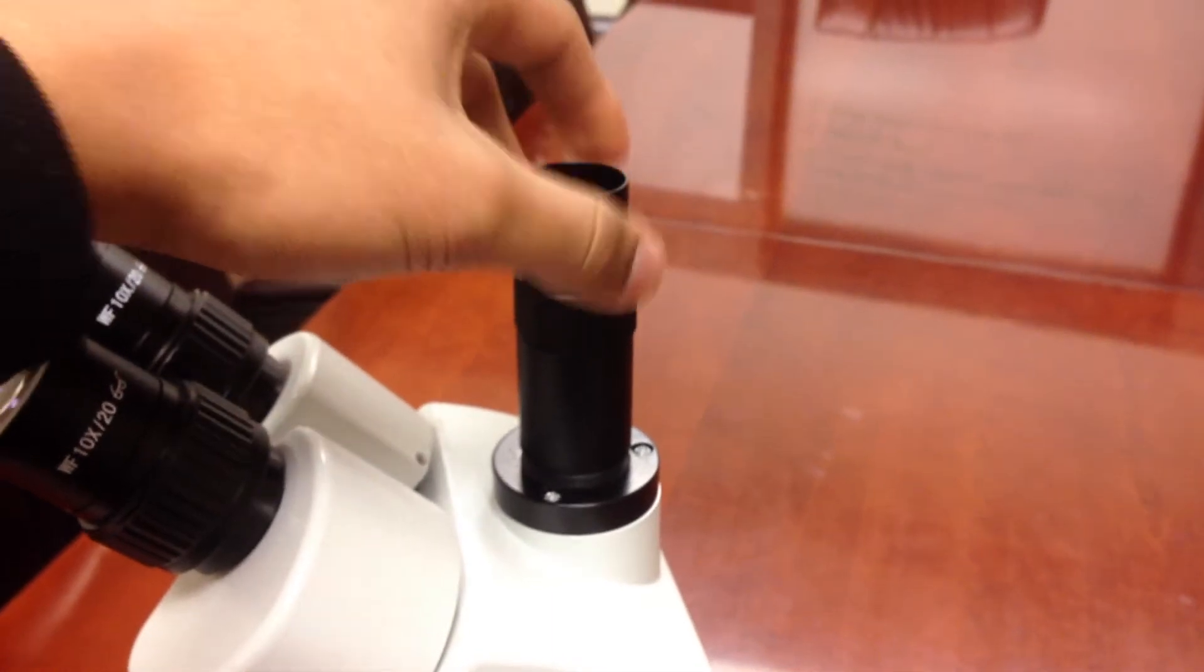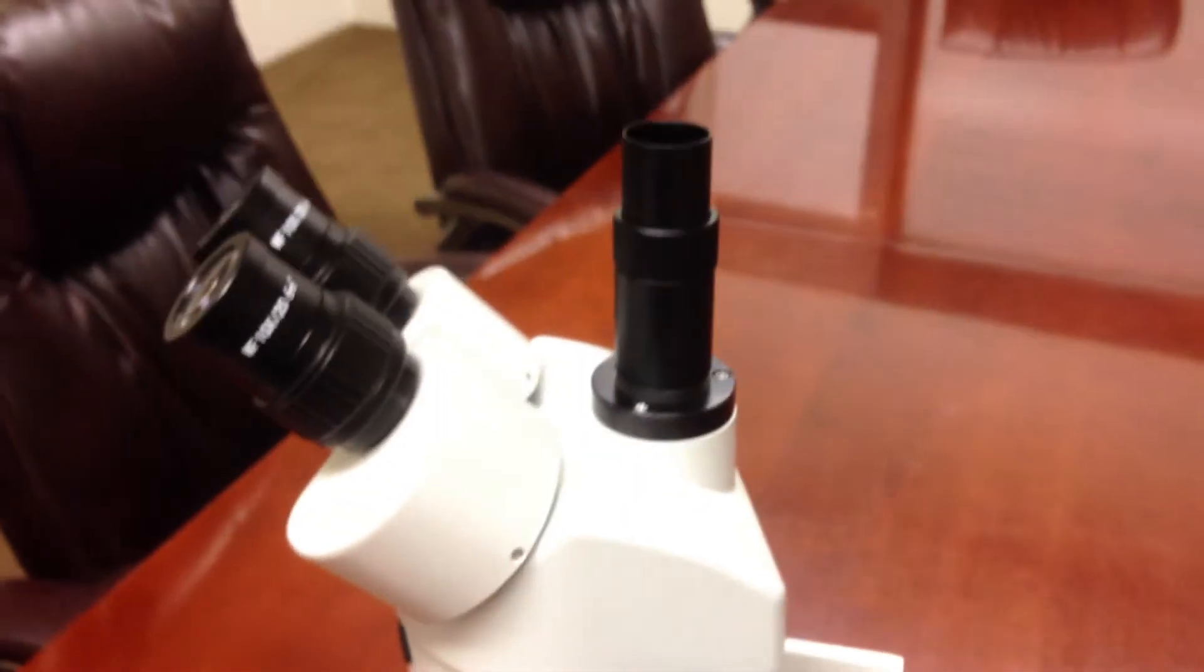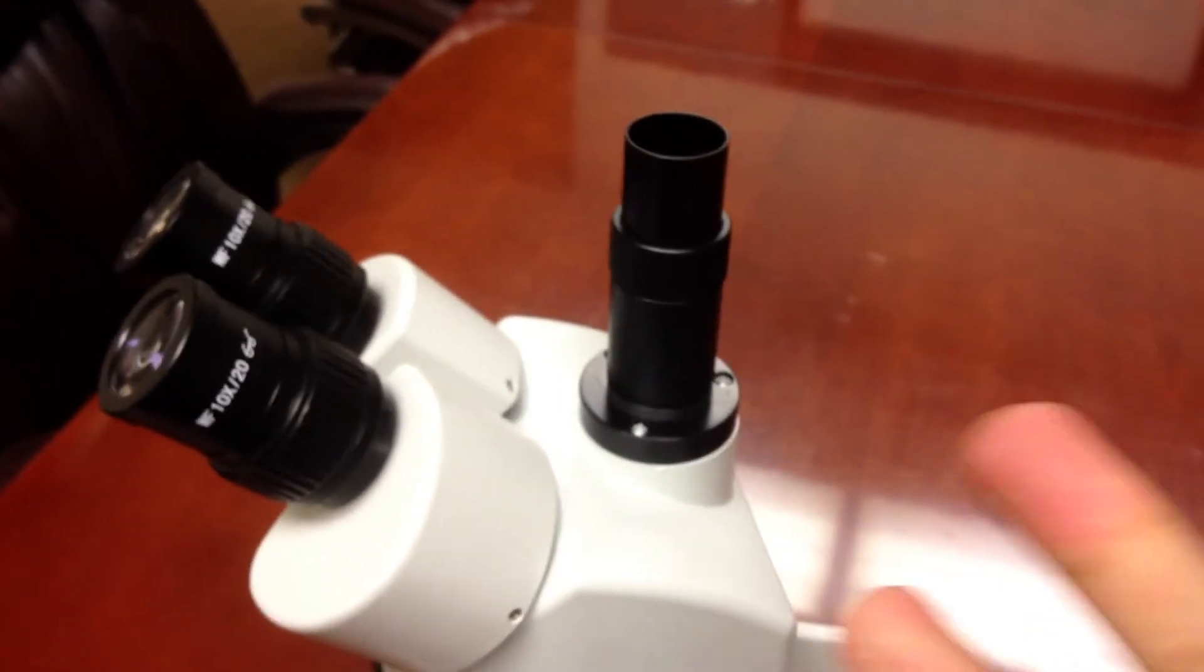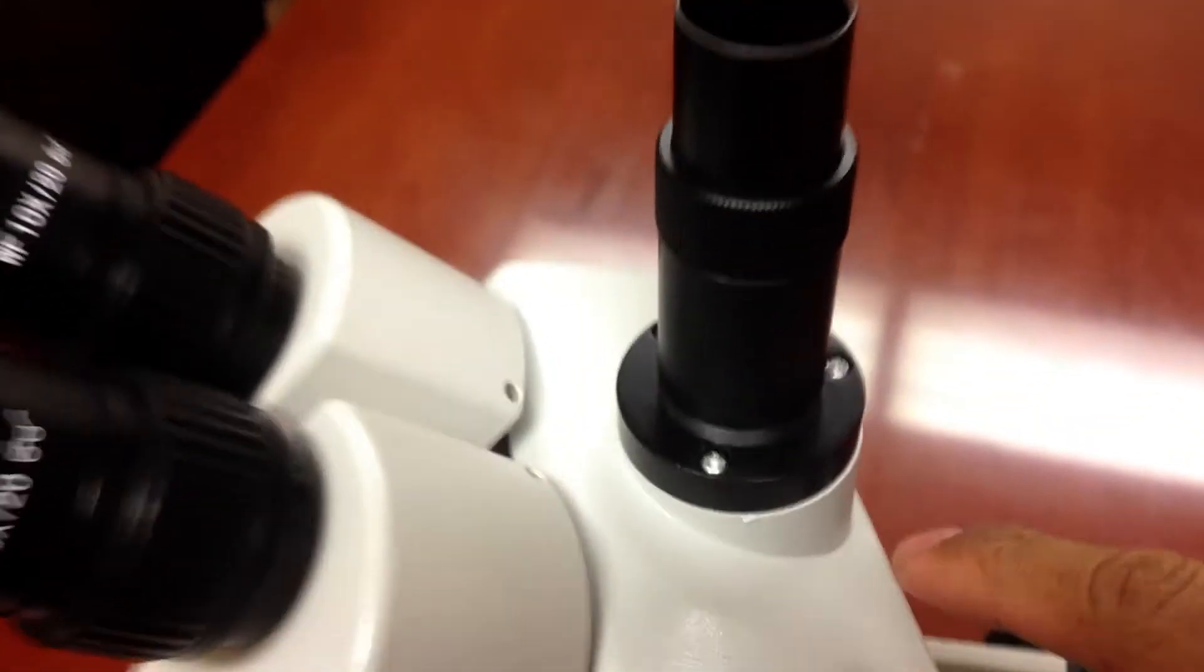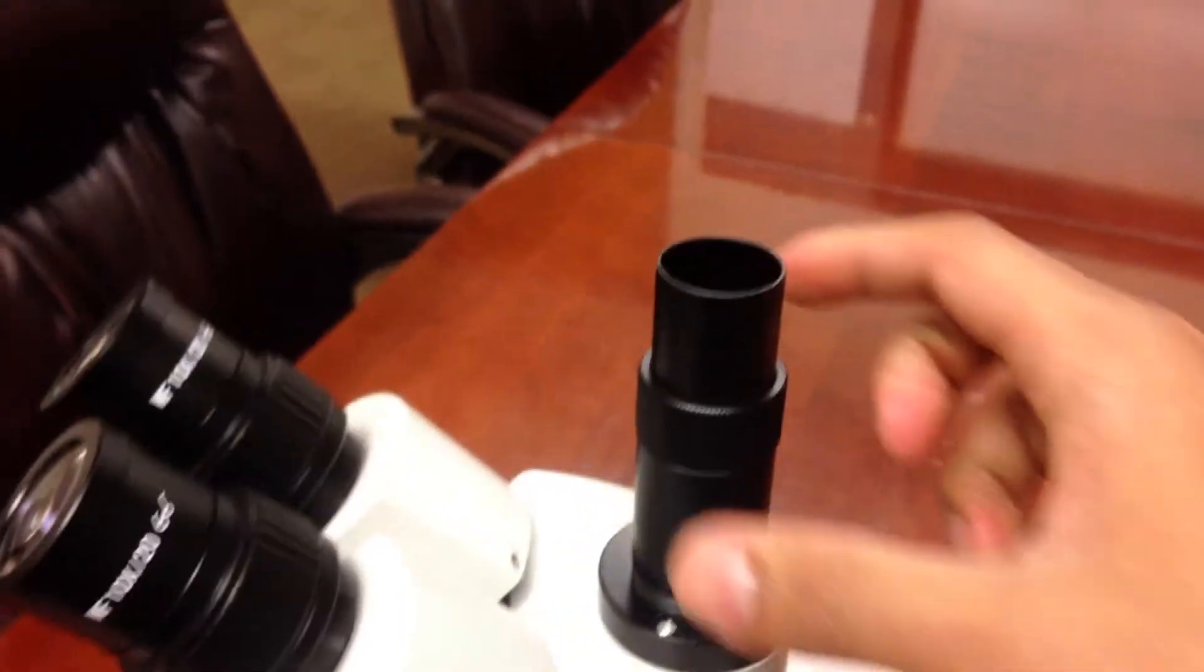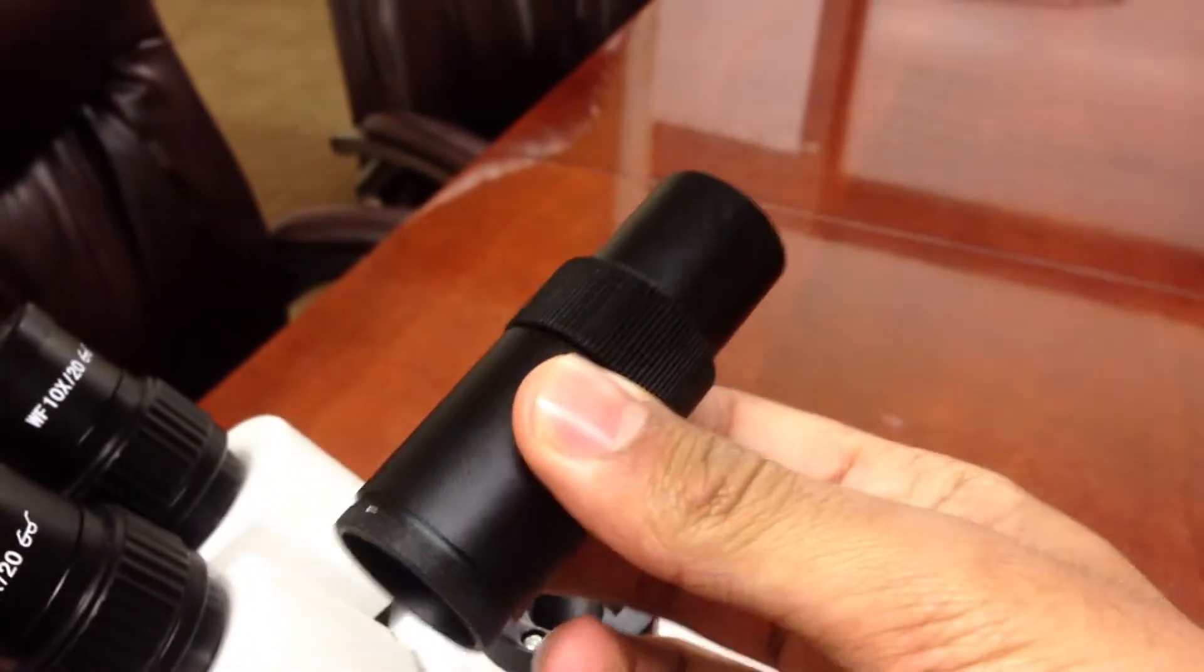So when mounting the adapter, what you're supposed to do is basically unscrew the trinocular port. But when I say unscrew the trinocular port, I don't want you to unscrew the one, two, and three Phillips head screws. Rather than doing that, I just want you to take out the long tube.